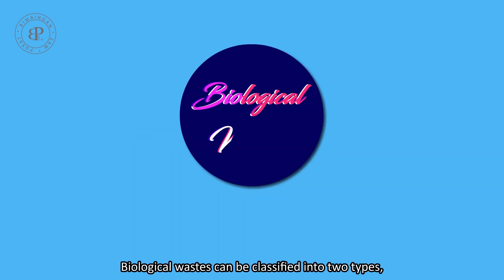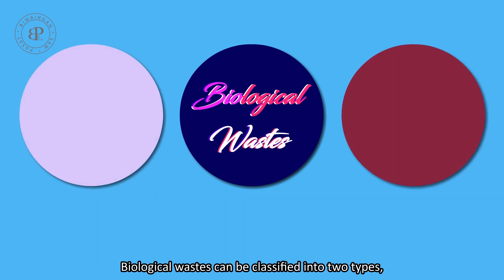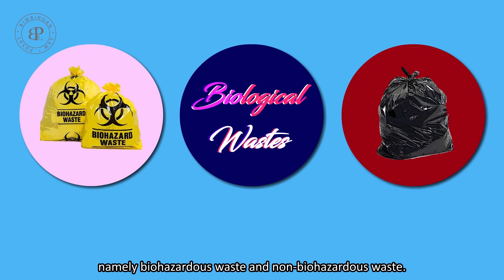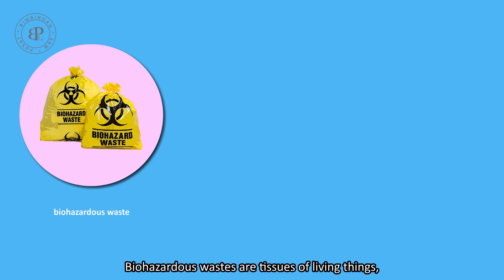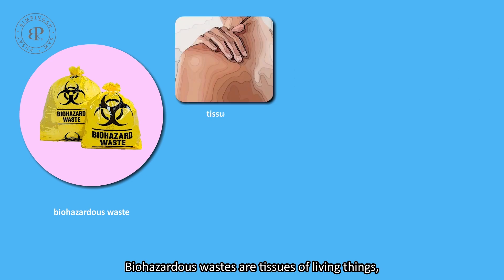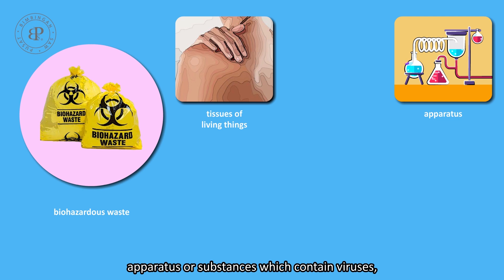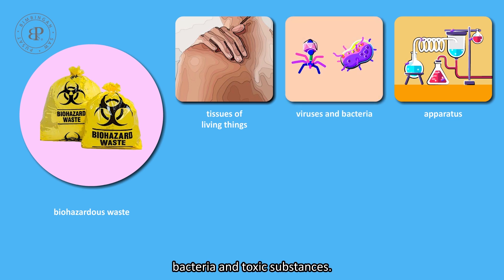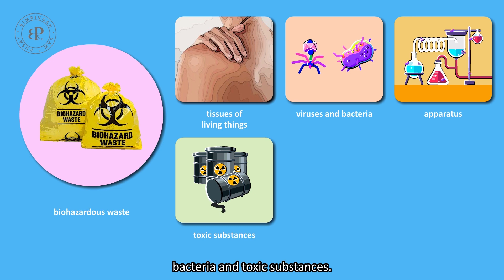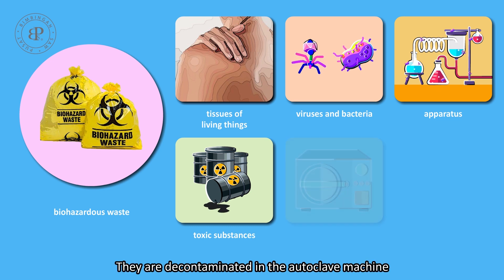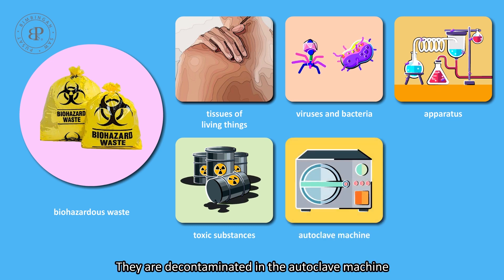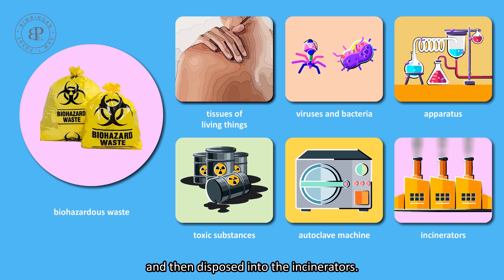Biological waste can be classified into two types: biohazardous waste and non-biohazardous waste. Biohazardous waste are tissues of living things, apparatus or substances which contain viruses, bacteria and toxic substances. They are decontaminated in the autoclave machine and then disposed into the incinerators.